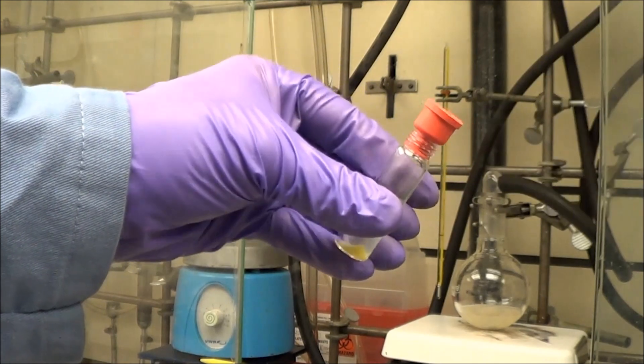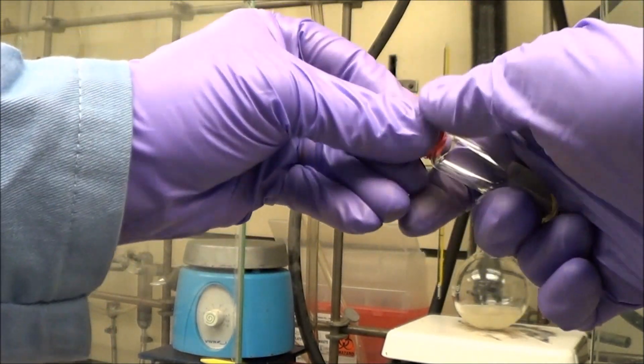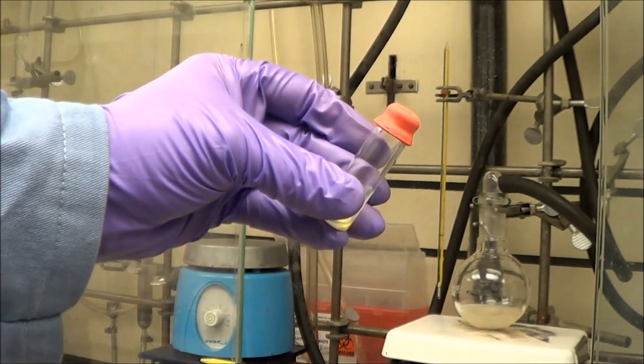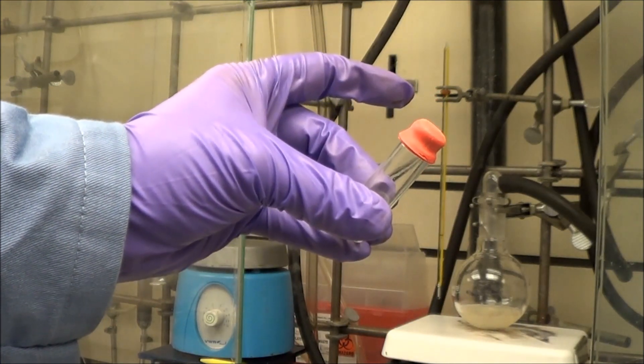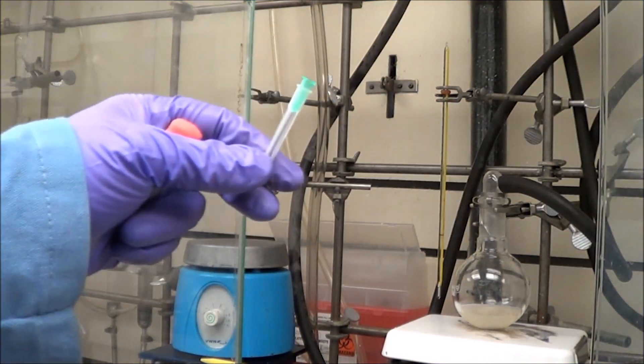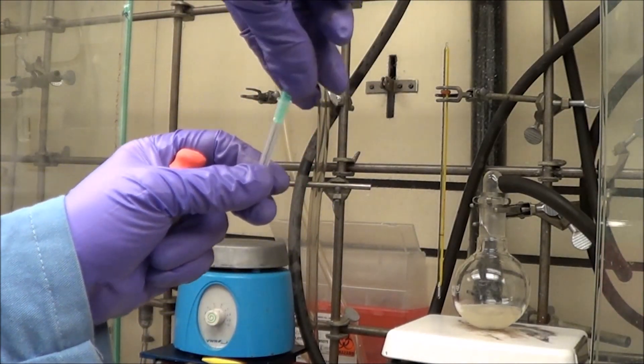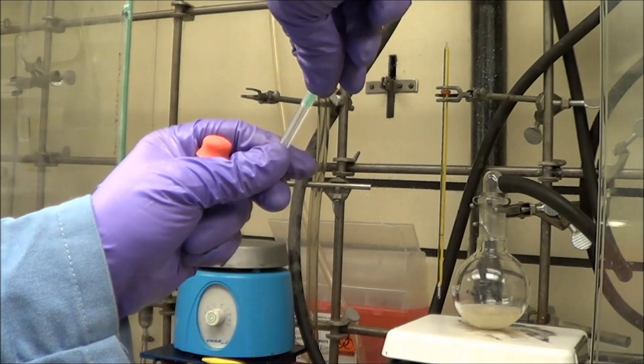We're going to dry it by attaching it to the Schlenk line, and to do so we put on a septa cap first. It's a little hard to get on there, but it's important because then I know it has a good seal. The harder it is to get on, the better. We're going to use a 21-gauge green needle to puncture the septa and attach it to the Schlenk line.